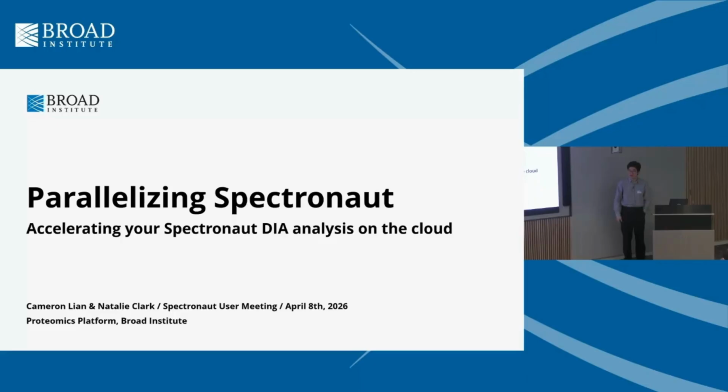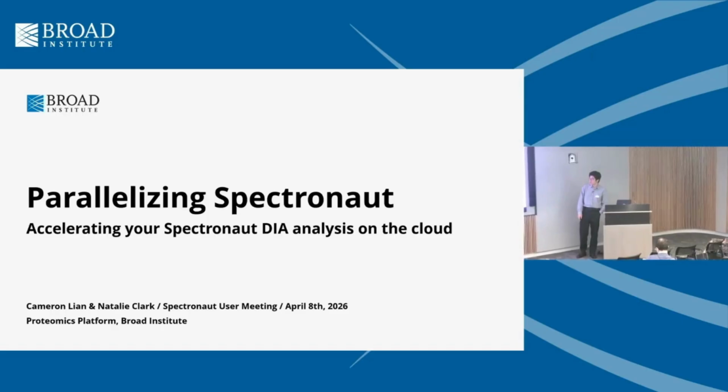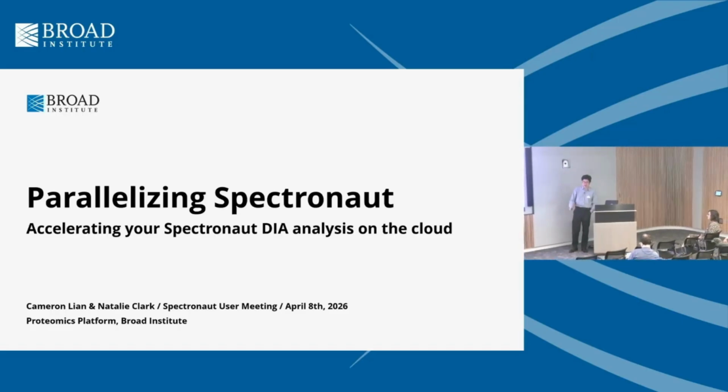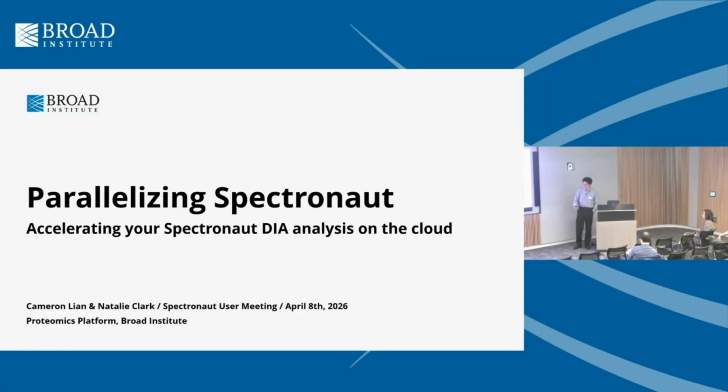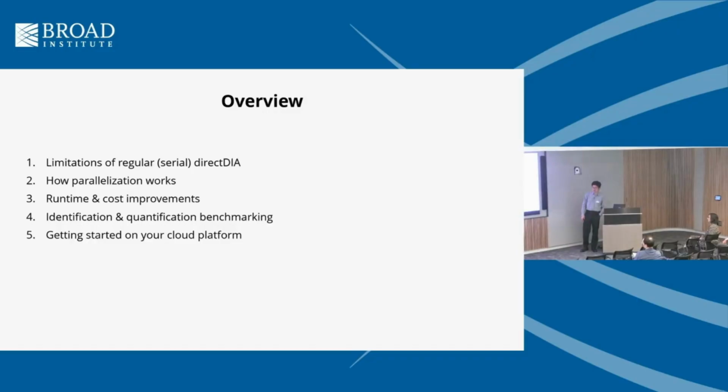We'll be showing you something that we've been working on for the past few months, parallelizing Spectronaut and running it on the cloud across multiple virtual machines, which really speeds up the data pipeline for Spectronaut and also at lower cost. So here is an overview of what I will be covering today.